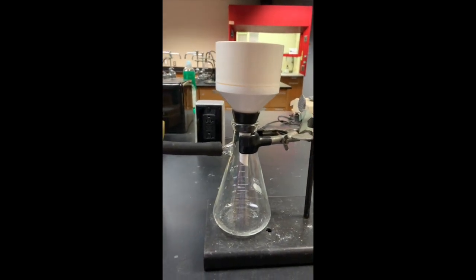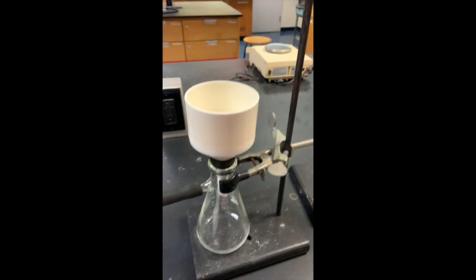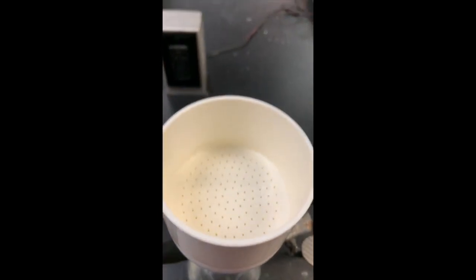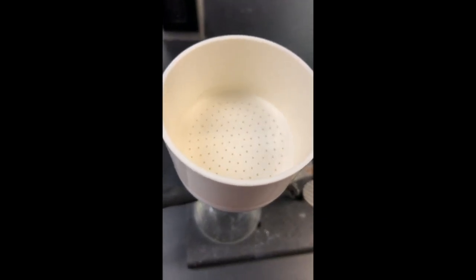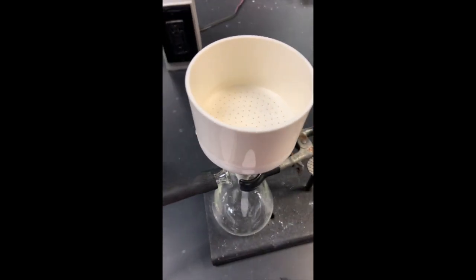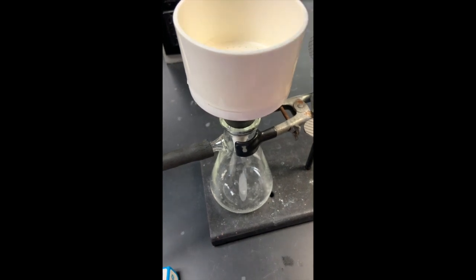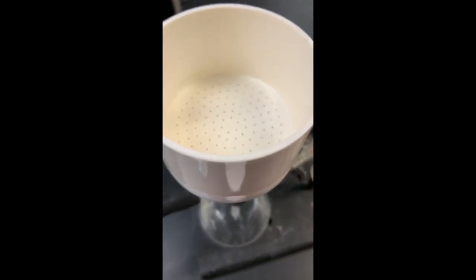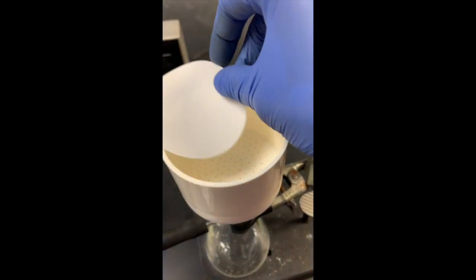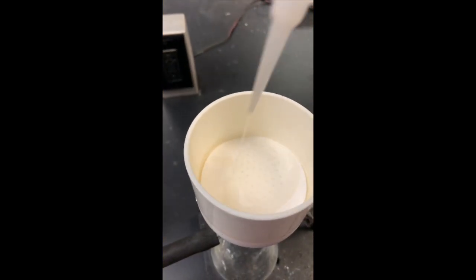So what I'll do to get my vacuum filtration setup going is I'll take a piece of filter paper here and I'll put it into my funnel. If you see the funnel there, there's all these little holes. What that looks like when you just put some water in is the water runs through those holes. These holes are a little bit too large for me, and I don't want to lose any of my product. So I put a filter paper there, and I'll wet it.